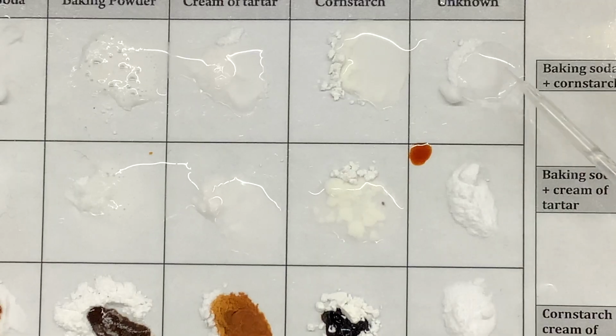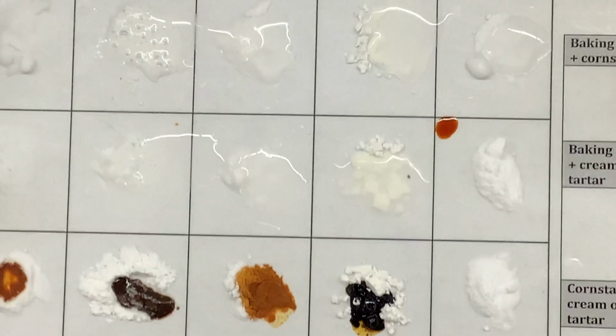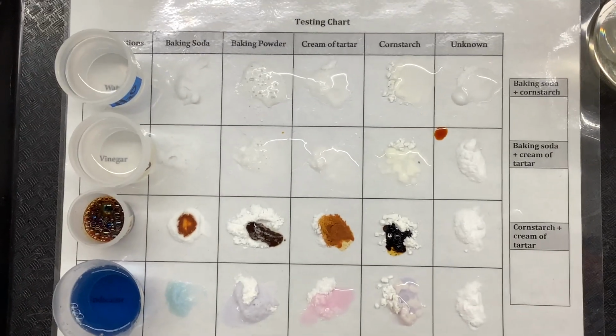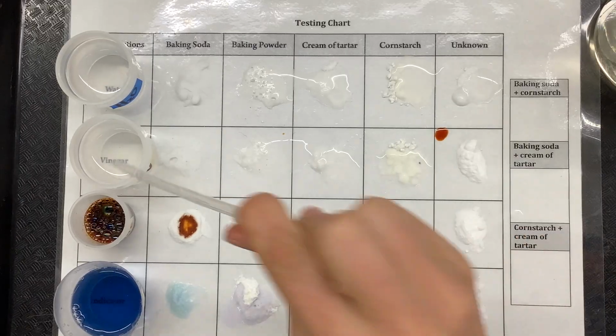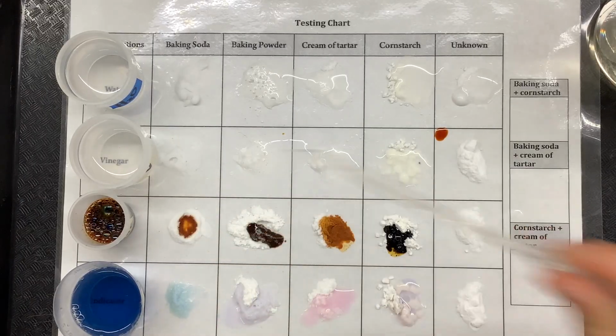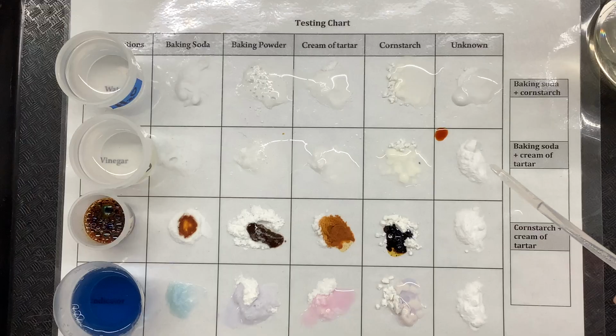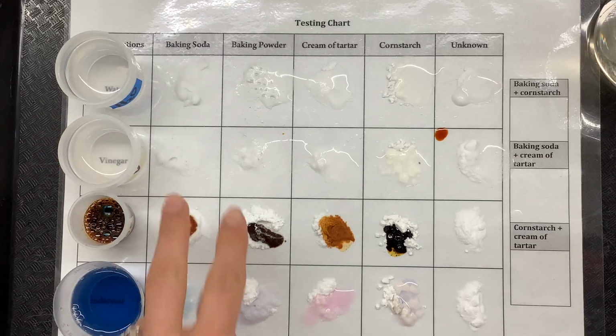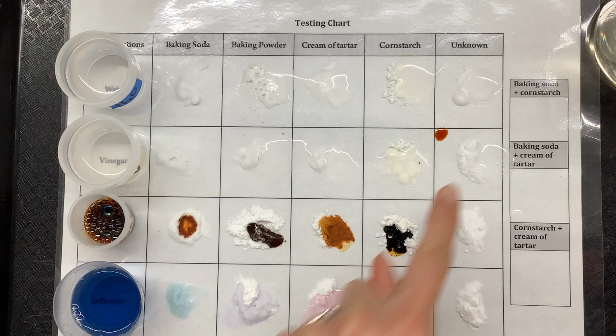Looks like just a mixture going on there. White, no bubbles forming for the unknown and water. Okay, let's try vinegar. Oh, yeah. Wow, that's a lot of bubbles for that one. These two bubbled like that.